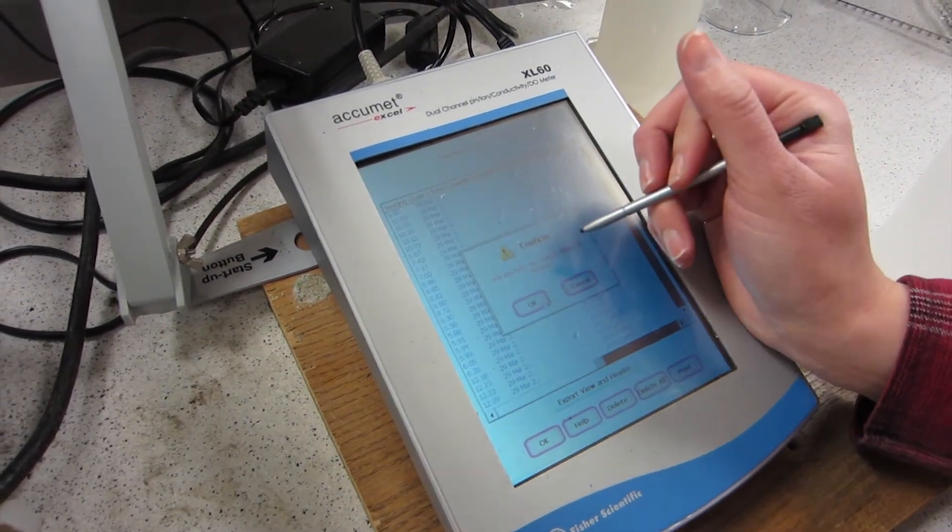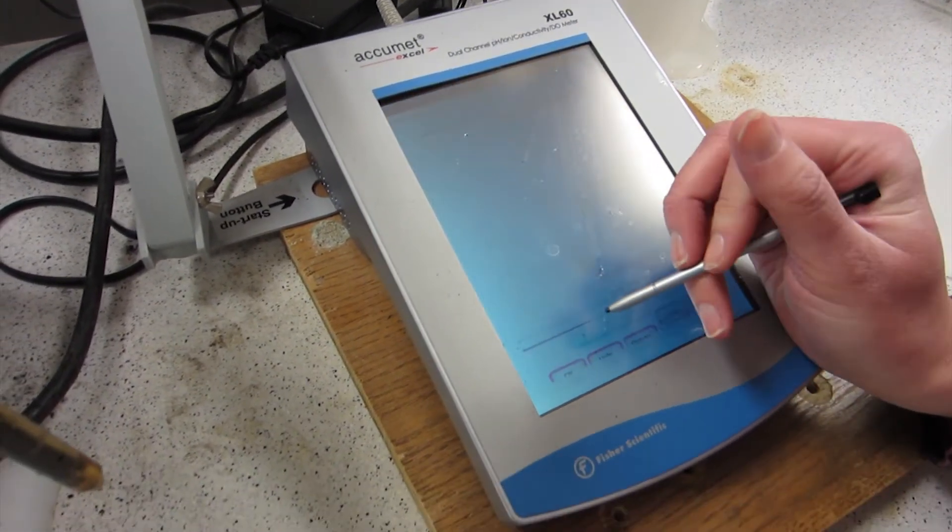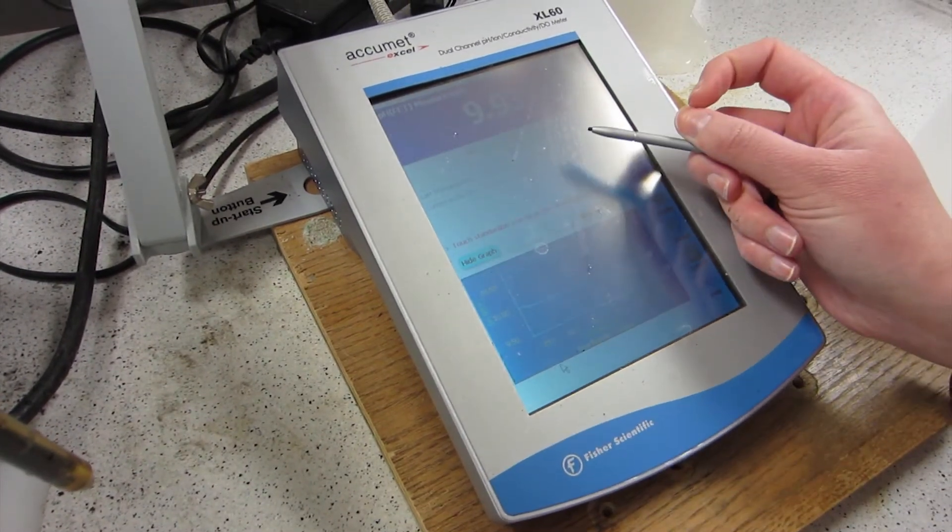So you go to delete all, OK, and then hit OK twice to return to that other screen. And now it's recording again.